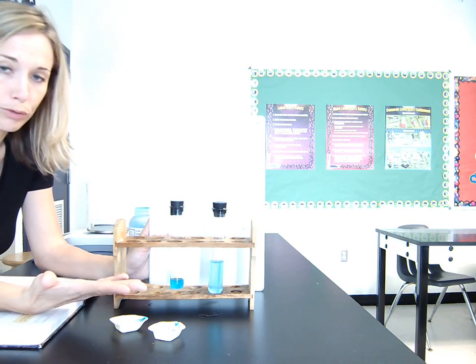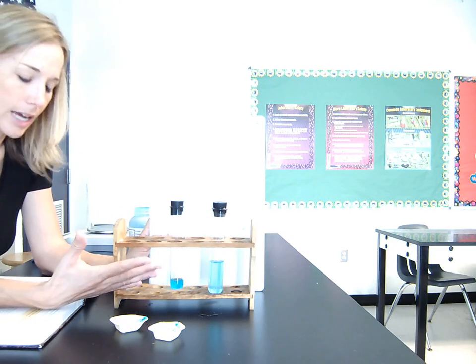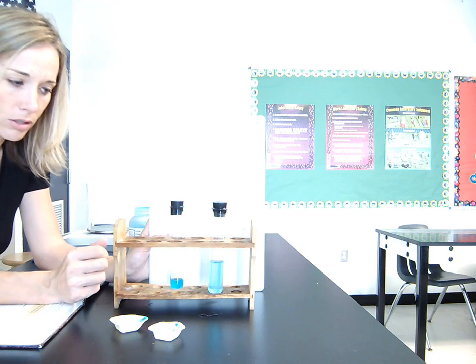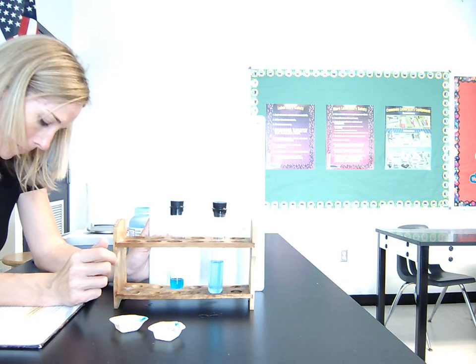And we call that word uniform. Does it dissolve uniformly throughout the solution? Yes, it does absolutely dissolve uniformly. So every cubic centimeter has the same amount of dissolved solution or dissolved solid as every other cubic centimeter.